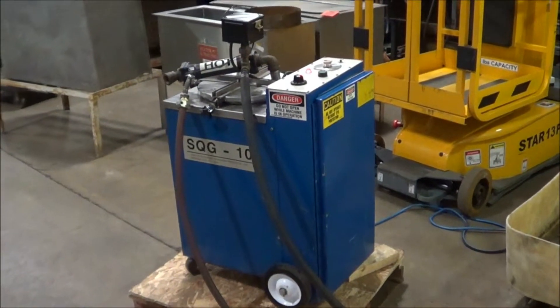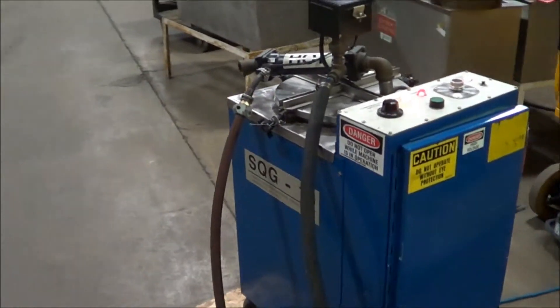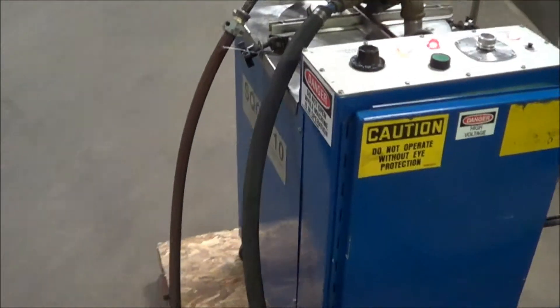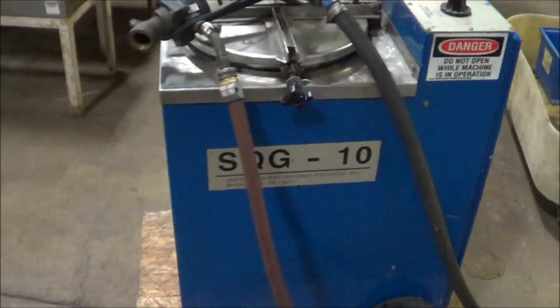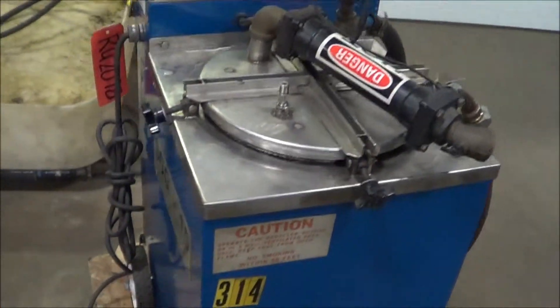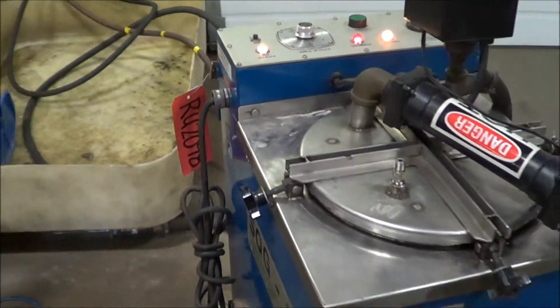Hello, you're looking at a water recovery design products recovery unit brought to you by Lanco. This is a still — a solvent recovery still system. It has a 10-gallon tank on it. It's a 120-volt single-phase unit, hooked up to power and water. This is used to distill or recover solvents and has a wide range of applications.